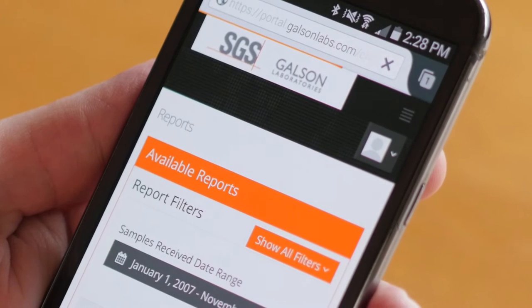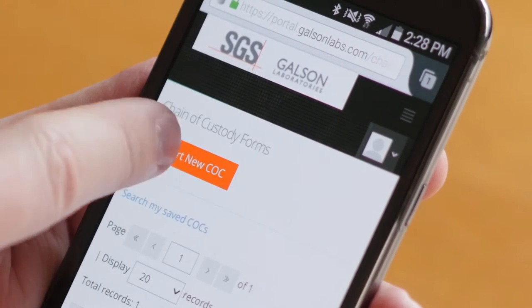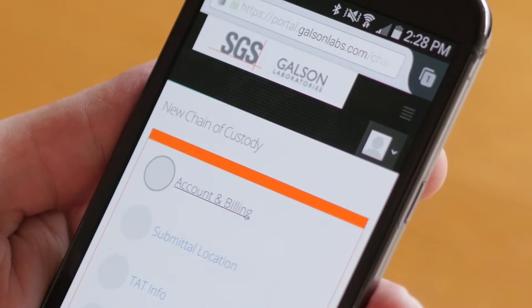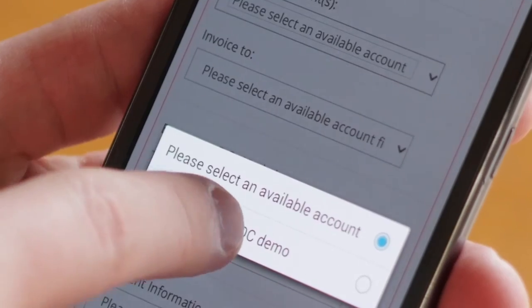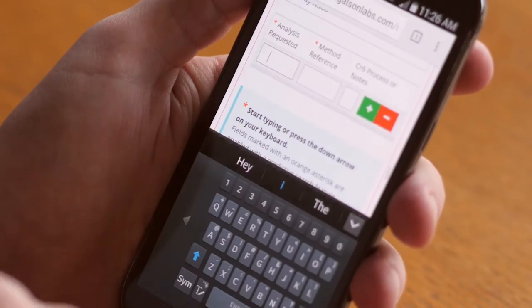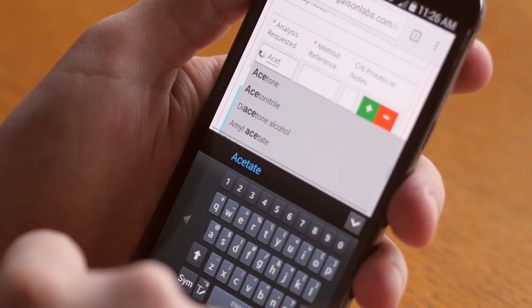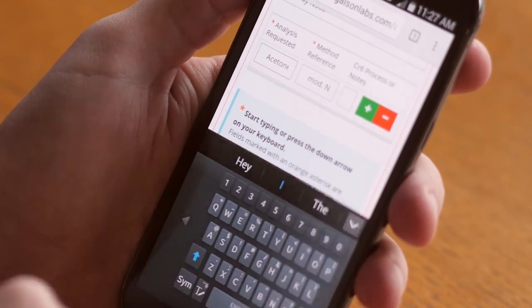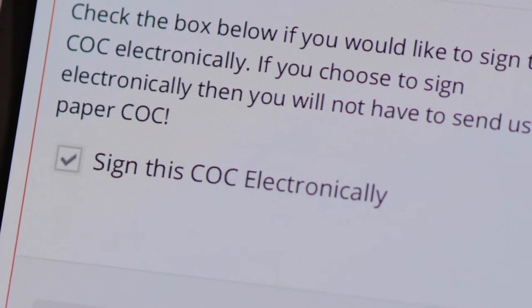Go to the online COC section and start a new online chain of custody. Fill out a few basic fields, let us know who should get the report, fill in your sample information, and sign electronically. It's really that simple.